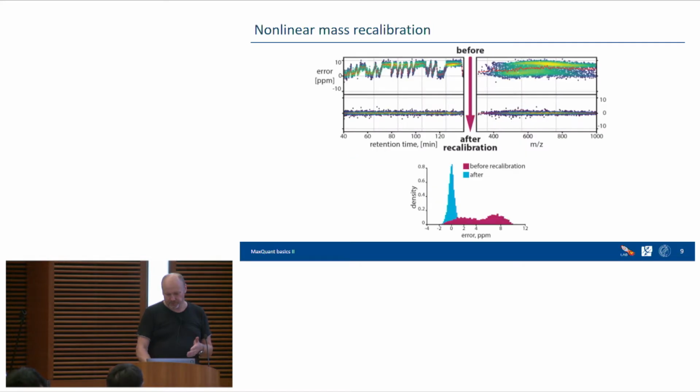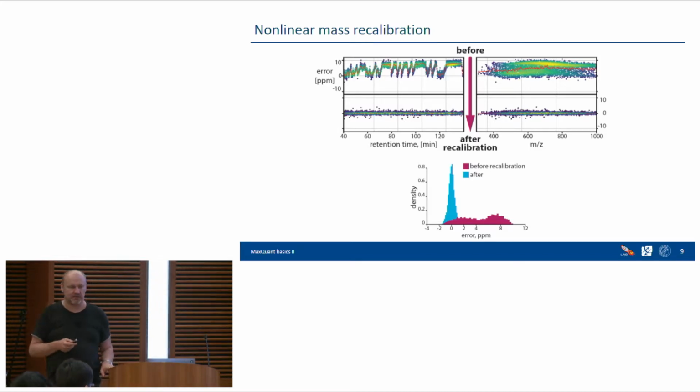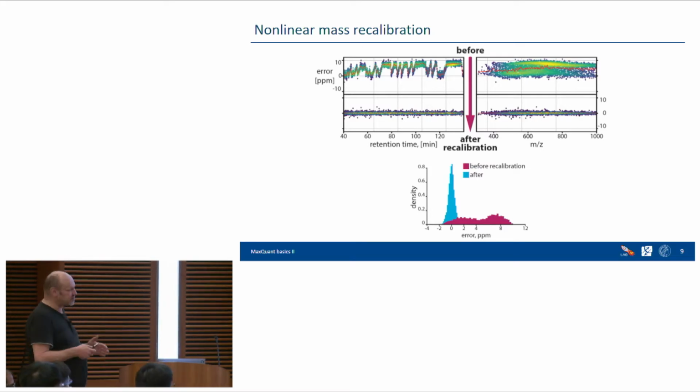As you saw in the LC-MS, in the case of standard LC-MS data, we do the correction of systematic errors based on this first search, main search principle, so that we do a first search with Andromeda just to create these recalibration curves, right? The results of the first search will not go into the result tables, they're just there to produce recalibration curves, and we do exactly the same thing here, right?